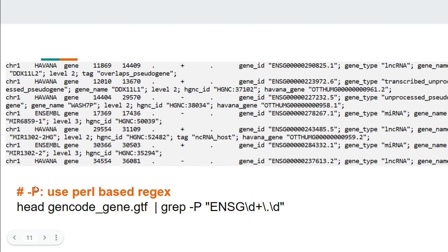Now let us use hyphen P. Capital P is for Perl-based regular expressions — using hyphen P we can give complex regular expressions. So hypothetically, what we have is a GTF file where each row contains gene information. The gene ID is present — this is the Ensembl gene ID — and we want to fetch this information. The pattern I will use is ENSG followed by digits: in Perl regex we denote digits as \d, then plus means one or more digits.